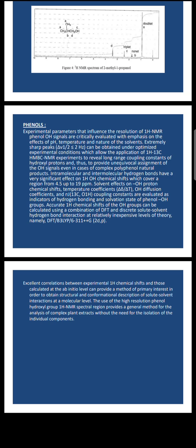The use of the high resolution phenol hydroxyl group 1H NMR spectral region provides a general method for the analysis of complex plant extracts without the need for the isolation of the individual components.